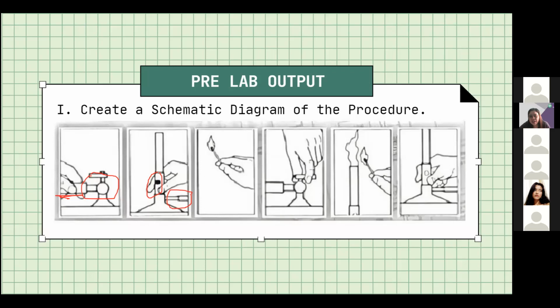And then after that, after closing the air hole, we will light syempre our match or anything na source natin, lighter or whatever is available in the laboratory. And then after that, i-open na natin class yung ating gas source. So yung gas source natin is actually the same thing na ginagamit natin kapag nagluluto tayo. Yung gasol, anyway, gasol is actually a brand name. But those are our sources sa gas pa rin sa laboratory. So ano sila? Mga carbon-containing na chemical na in gas form. So pwede siyang butane, pwedeng octane, pwede ding propane. So anything that is available.